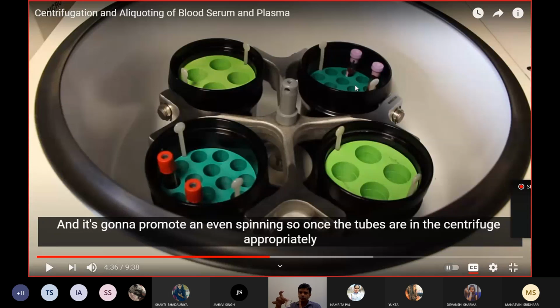Okay, so when you turn on the centrifuge, this will fly like this and this will move in this way, right? So this is the swing rotor bucket. Some of them are fixed, right? So they are at this angle, and they will only move like this, so they cannot swing.